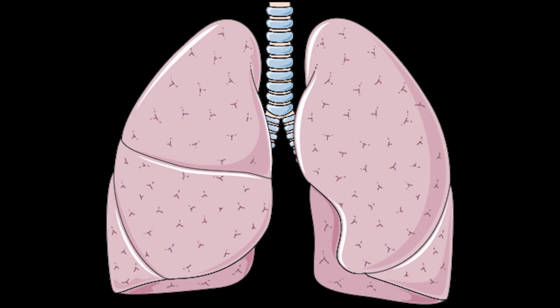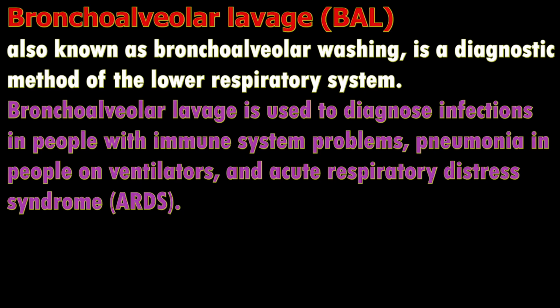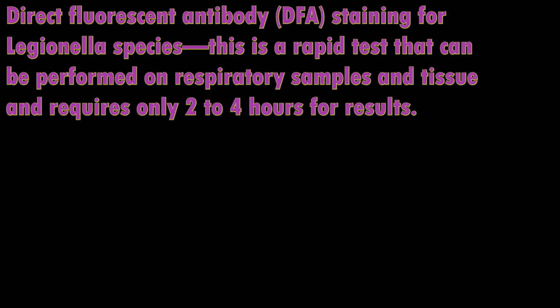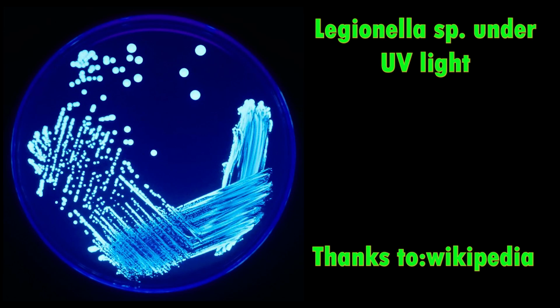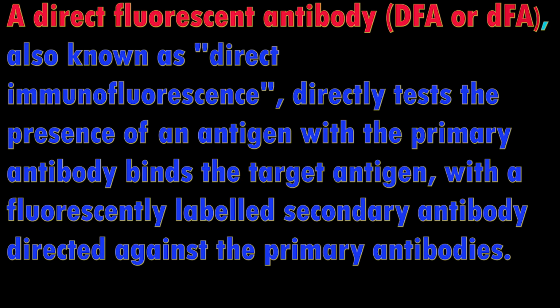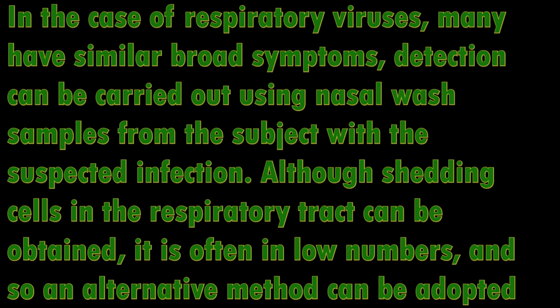Respiratory tract, bronchoalveolar lavage: gram stain and other special stains as requested. Example, Legionella DFA, direct fluorescent antibody stain, and acid fast stain are normally done. The plates are blood agar, chocolate agar, and MacConkey agar. Sputum or tracheal aspirate: gram stain and other special stains as requested. Example, Legionella direct fluorescent antibody stain, acid fast stains are normally used. The plates are blood agar, chocolate agar, and MacConkey agar.